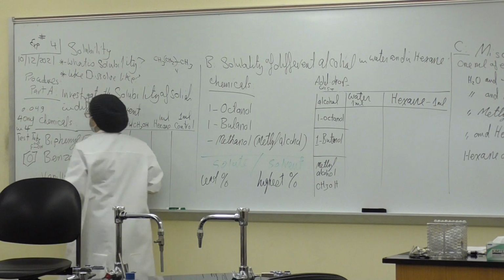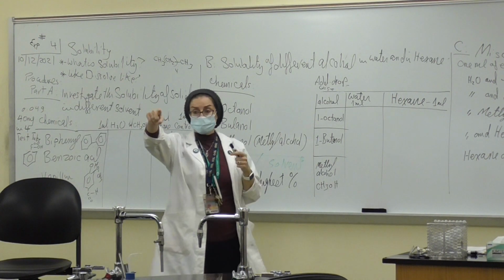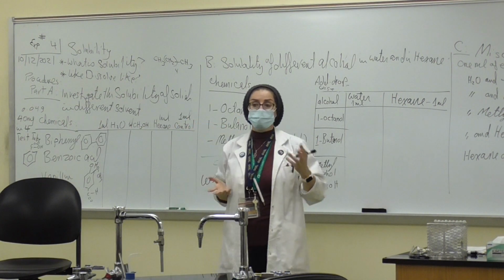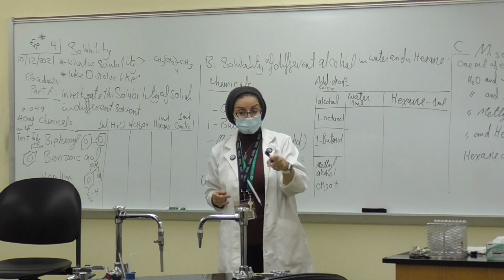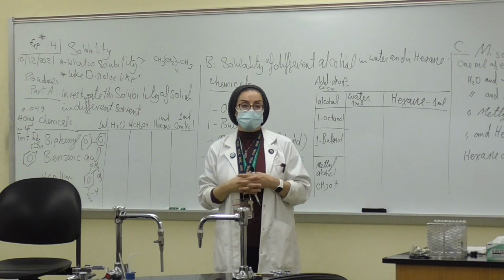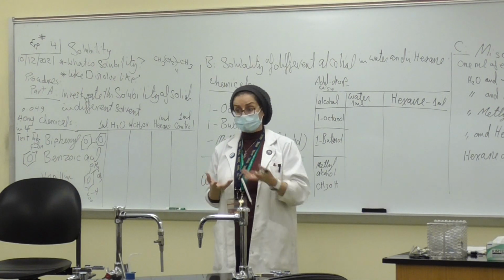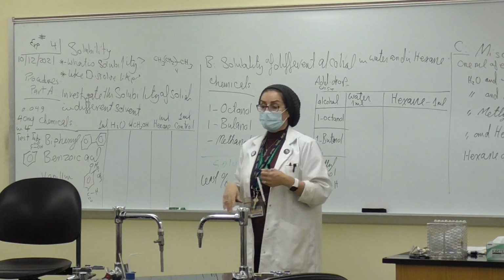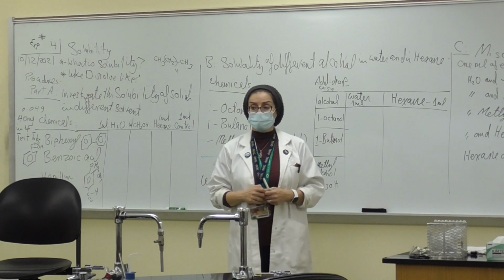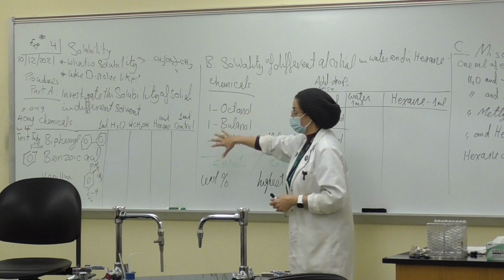0.04 of the gram. And you have the very sensitive balance that you can weigh with it. I put the weighing boats over there. You have the spatula. You are going to be able to measure all the chemicals. The 3 chemicals are there, and use them as you go for part 1.